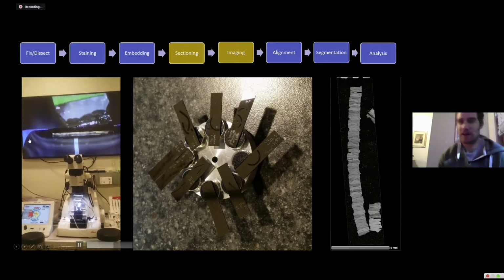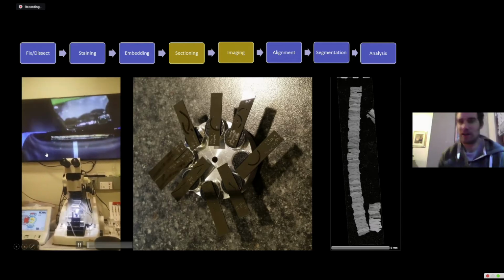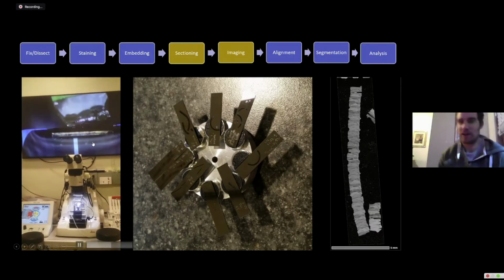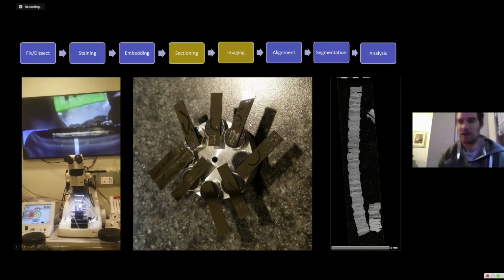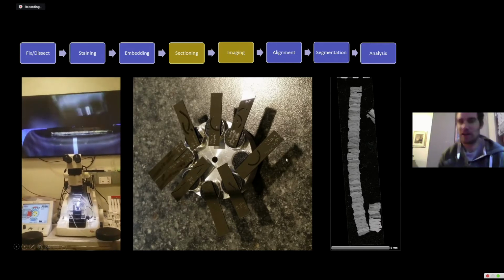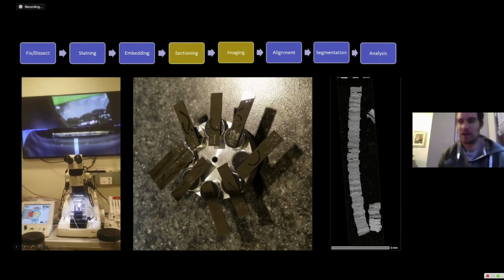The knife is filled with water, called a boat, so that as the sections come off the knife edge, they float out on water and create a perfect ribbon. Then we can collect those ribbons on silicon chips that you can see here. Some of them are more perfect than others. And then we can put these chips inside of the electron microscope.